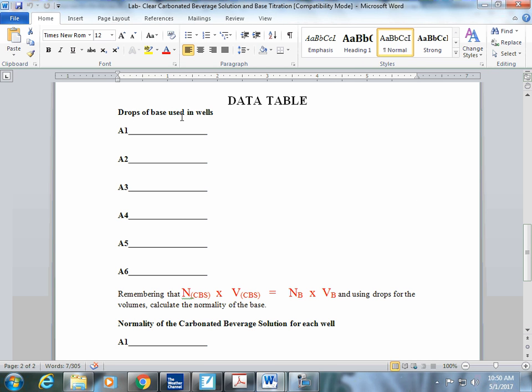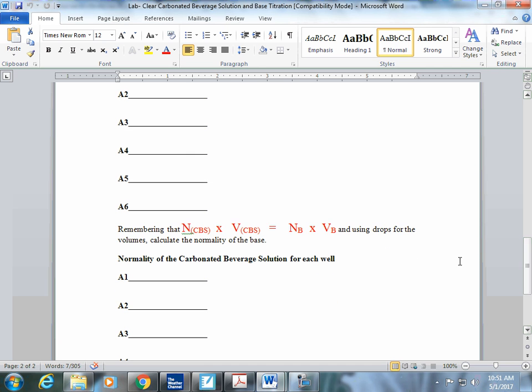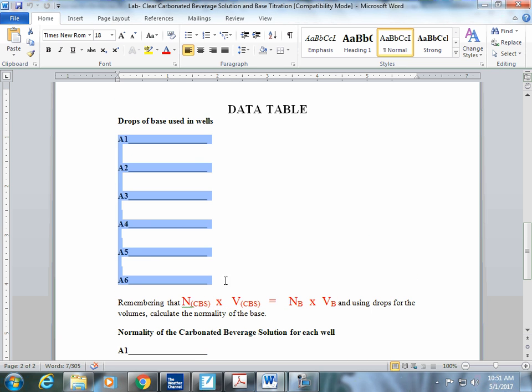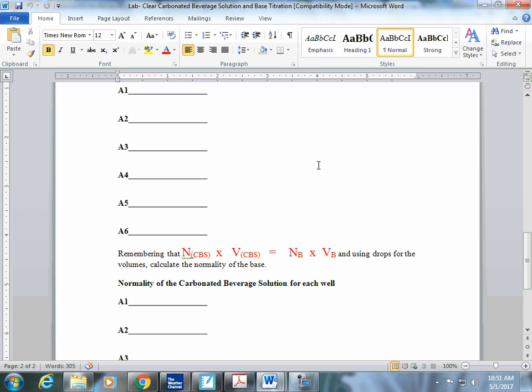All right, right here we have calculations. We're going to have drops of base in A1, A2, A3, A4, A5, A6. So we'll know how many drops of the base it took. All right, we need to use this calculation right there. Remember, the normality of the carbonated beverage solution times the volume of the carbonated beverage solution is equal to the normality of the base times the volume of the base. Okay? These numbers right here are all going to be the volume of the base, A1 through A6 in your data table.